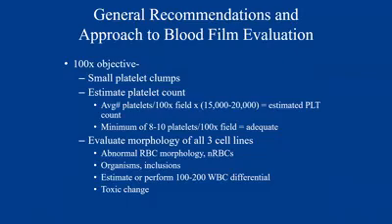I see a lot of beginner microscopists, mostly students here, who want to do all of their cell identification at 10x or 40x right away. They're really struggling to say, is that a neutrophil? Is that an eosinophil? Is that a monocyte? Is that a lymphocyte? They're missing platelets. It's all just because that's too far away when you're just learning. So really spend time on oil, and then as you get comfortable, you can back out to a lower magnification, and you'll be able to move faster.